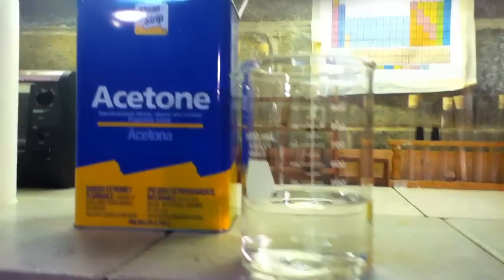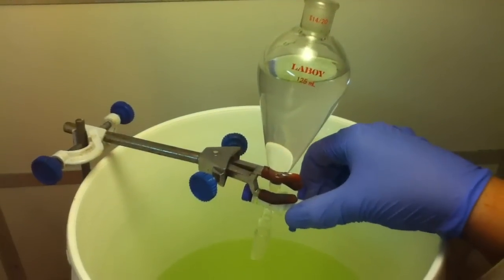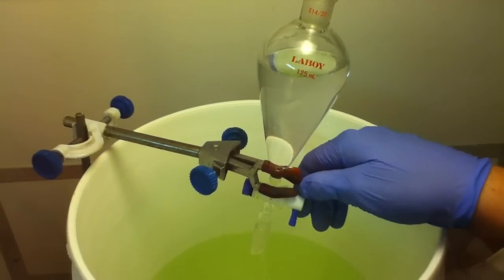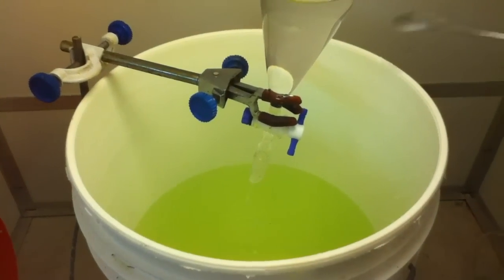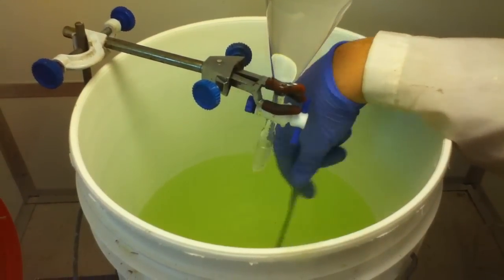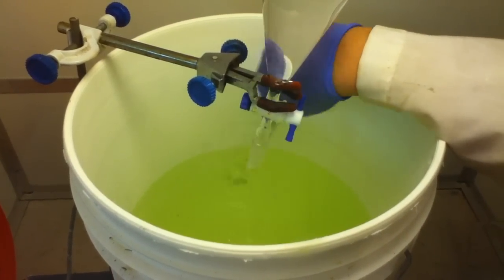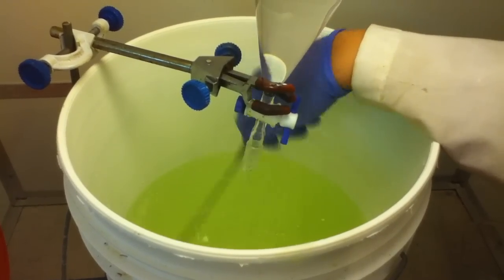Measure out approximately 400 milliliters of acetone. Add the acetone to a separatory funnel. Position the funnel above the bucket and adjust the stopcock to allow a slow stream of acetone to flow from the funnel.